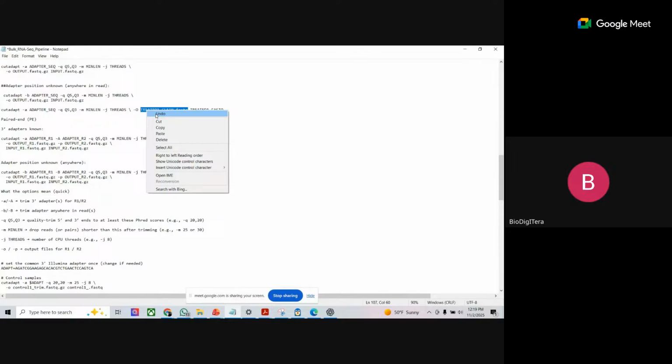Because you run the new QC to check if Cutadapt has cleaned up some dirt that you have in your data. You run the first QC using the raw data as input.